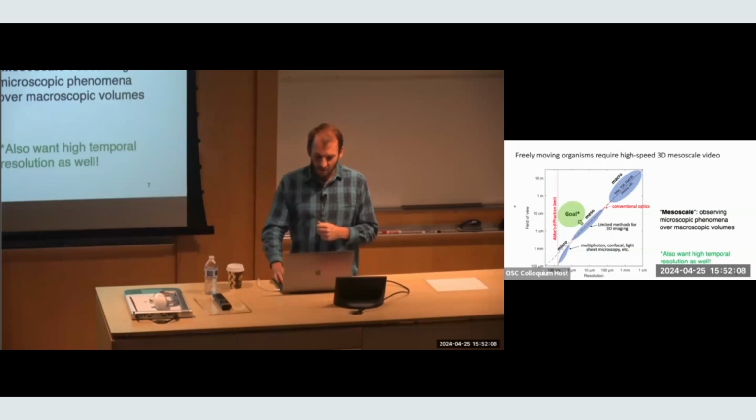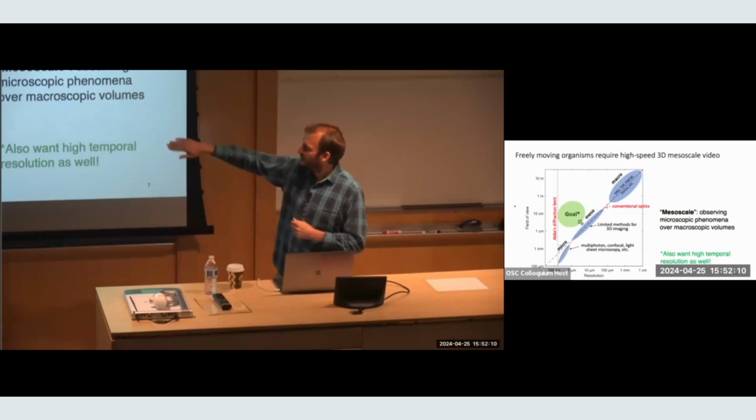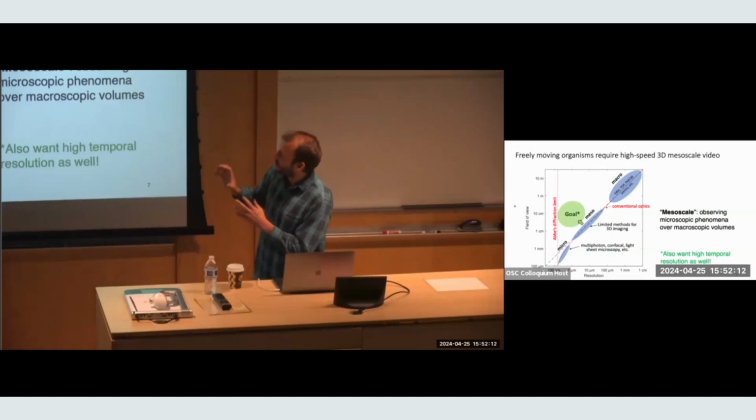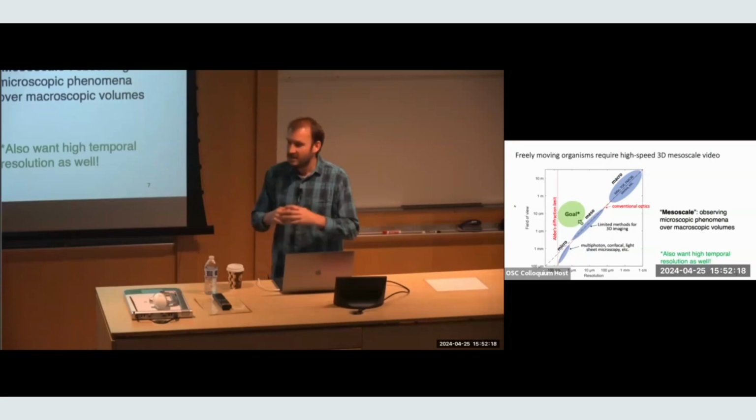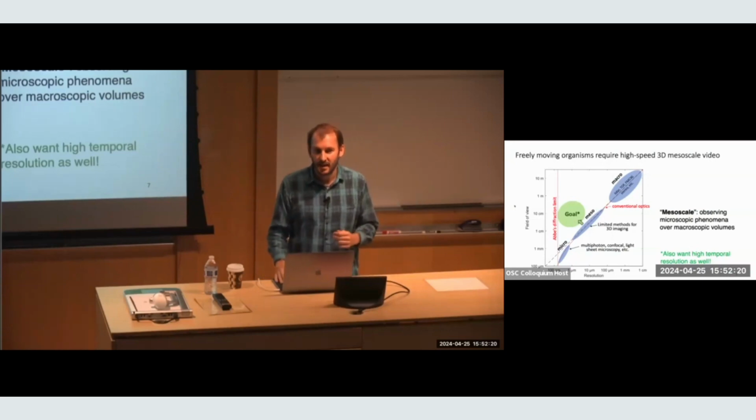And so we're on this curve here, and our goal is to push off and get a little bit beyond the standard trade-off between resolution and field of view, to see much larger areas at high resolution.